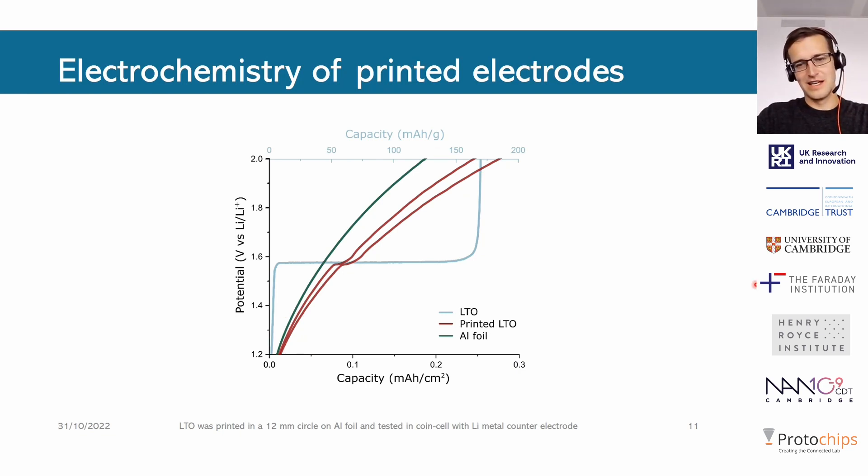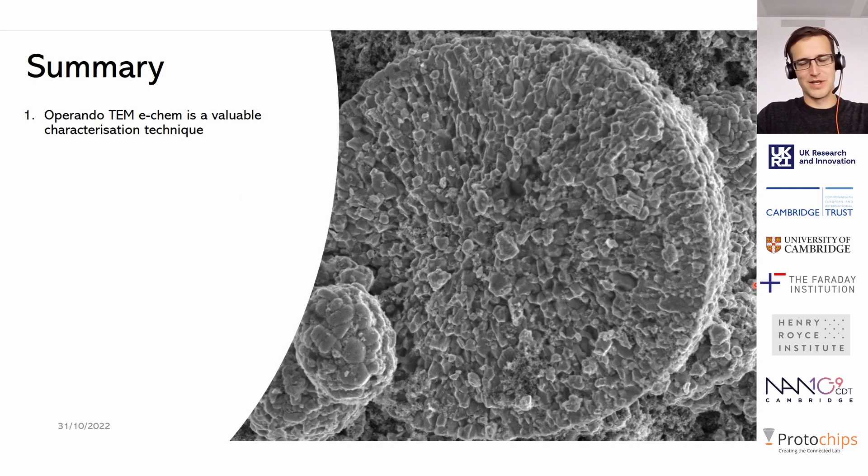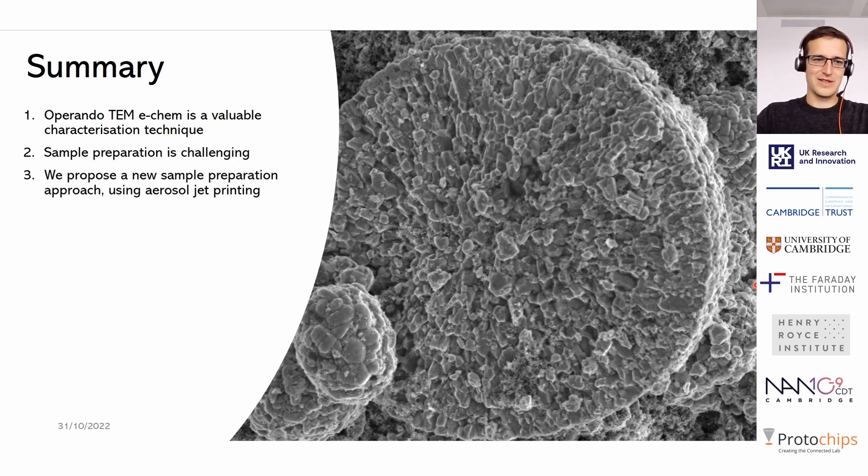We chose LTO for this test because it shows a very beautiful and very distinct plateau at about 1.55 volts, and this plateau is also present in the printed samples. There is some overlap with a signal from the aluminium foil itself, essentially due to the very thin LTO coverage being quite small, so we still get some side reactions from the aluminium foil.